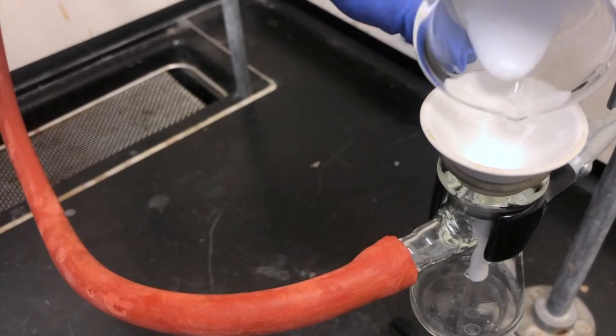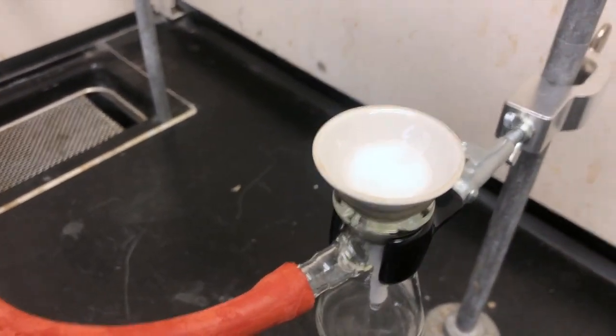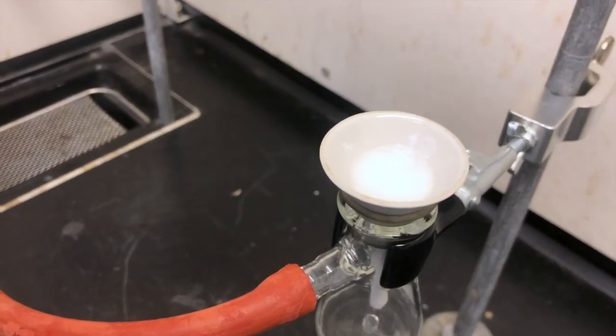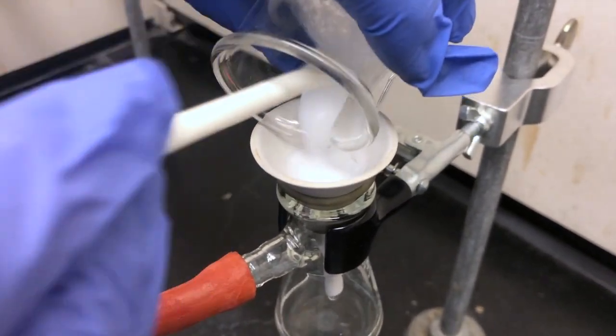Then we pour our mixture in and let it start to filter out the liquid from the solid, collecting our product on the filter paper in the Hirsch funnel.